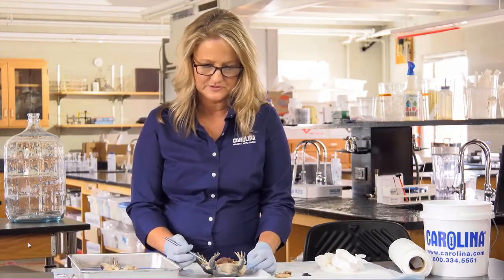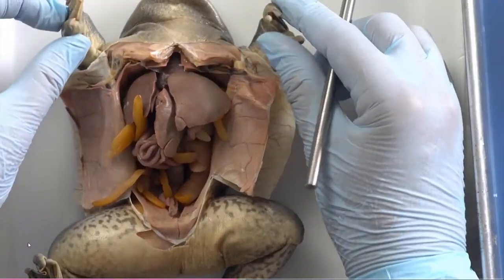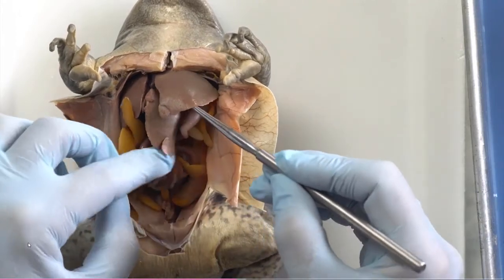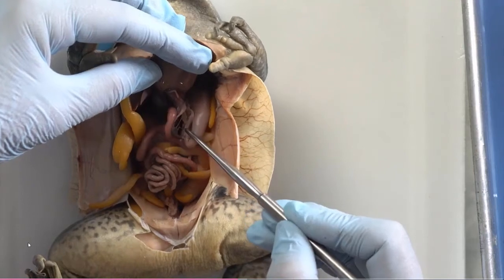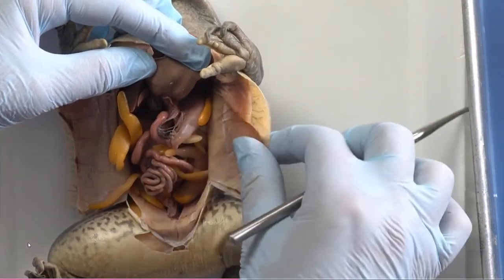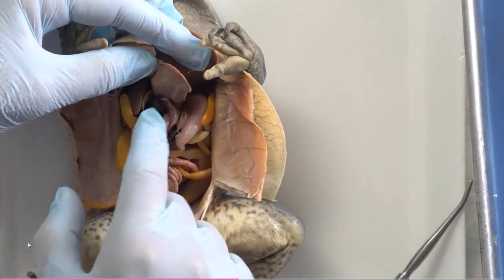Let's just review a little bit what we're seeing in the male frog that we have seen in the female. Here are the 3 lobes of the liver. Here's the stomach and there's the pancreas. And what we're obviously seeing that was not as visible in the female is these fat bodies.